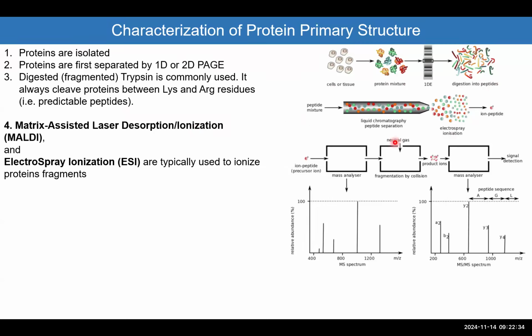Obviously, I have never done this in my life with all the experiments I did. Yes, I used the core that performed that, but I never did in my life an experiment where I operated this machine, and none of you is going to do unless you have many, many years of experience. Or by electrospray ionization. So this is a different way to ionize those peptides.